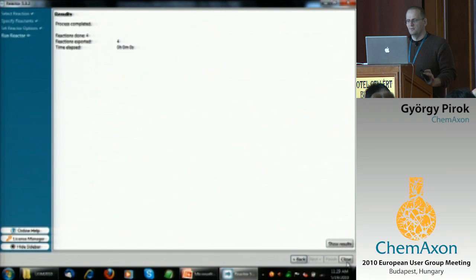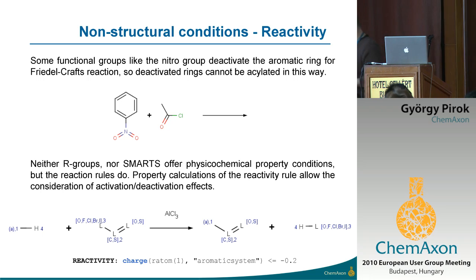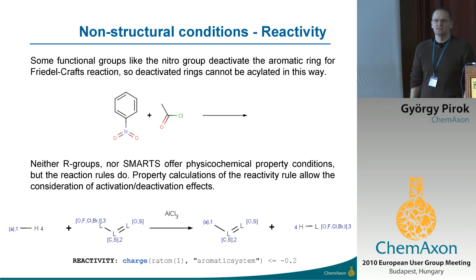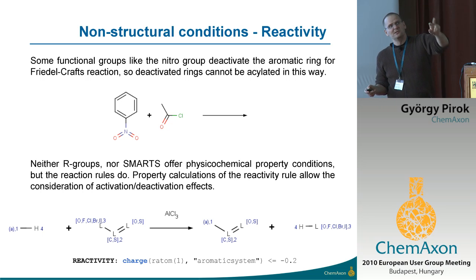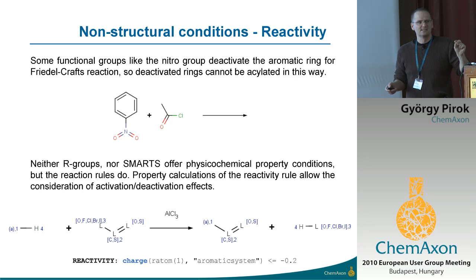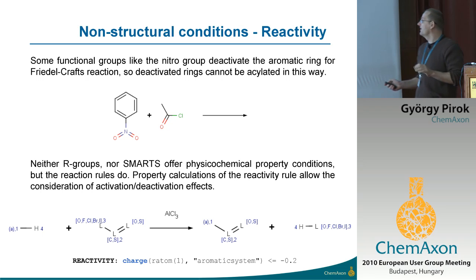So this was a reactor, and what I wanted to demonstrate only is that it can generate feasible products, if your reactions are feasible, because our software doesn't know chemistry. We neither. However, chemists know it. So what we wanted to create is a software in which chemists can include the rules. You know, the old professors watching your presentation at the university and telling you, I don't understand why you did it this way, because you should have known that those too many aromatics will make your entire reaction rotten. So if someone can tell this, we want to give a software in which you can include this knowledge, put it within the reaction. A reaction is a compact thing, so you can add some rules.